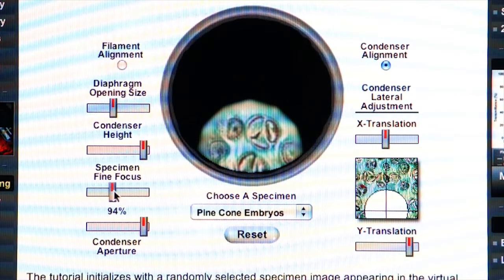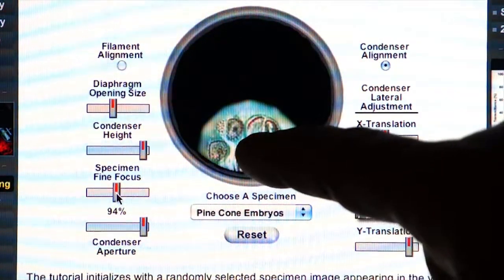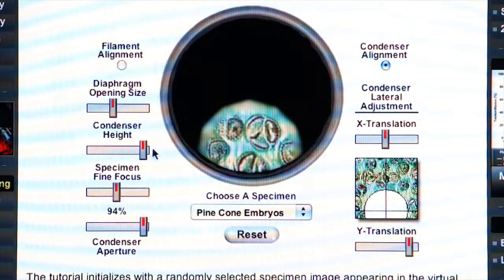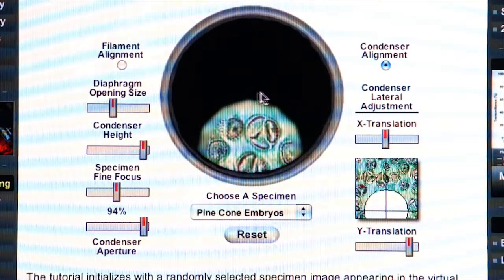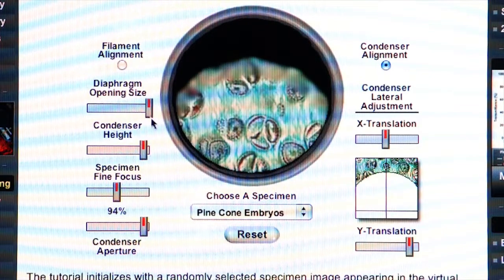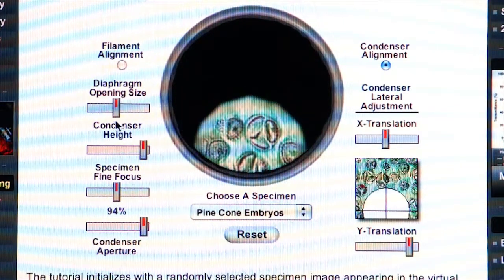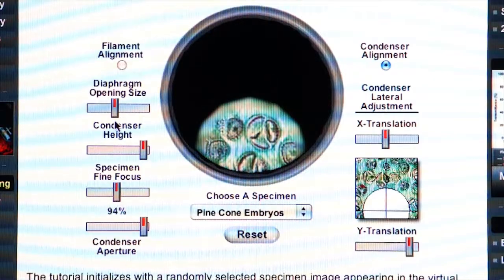We'll use this sliding bar to get our specimen in the field of view finely focused. Now you close down your field diaphragm so that you can see it in the field of view. We want to close it down enough to where we can see almost the whole diaphragm.